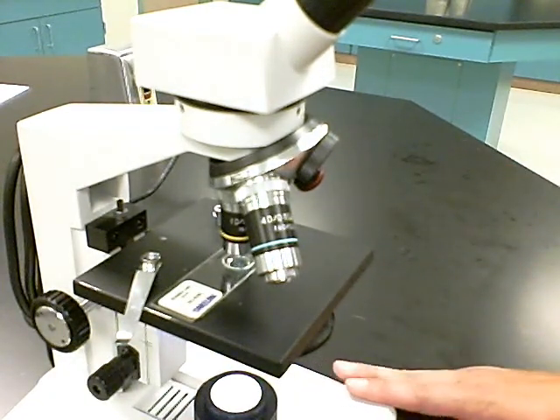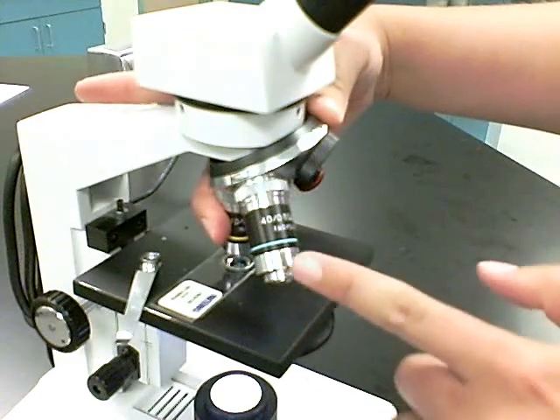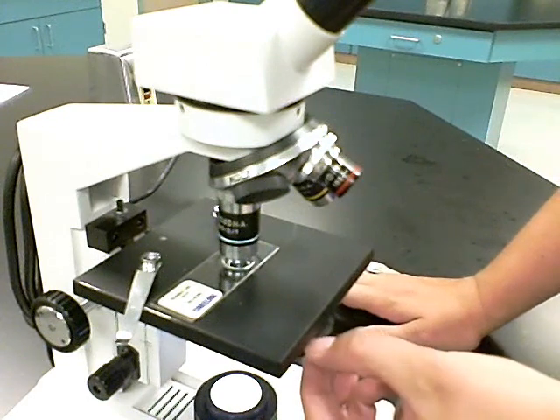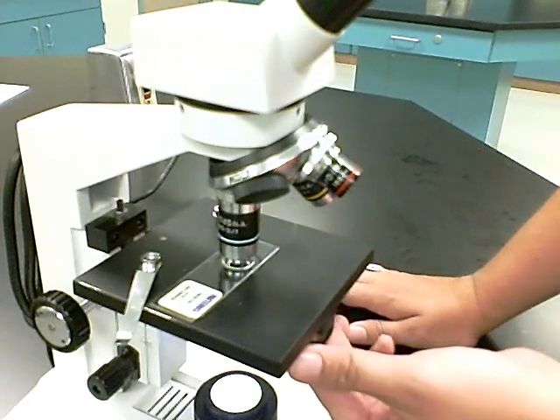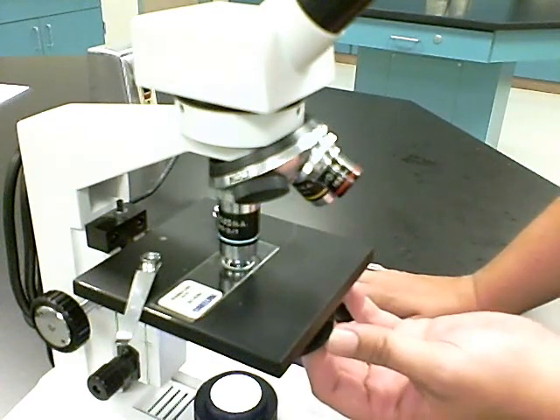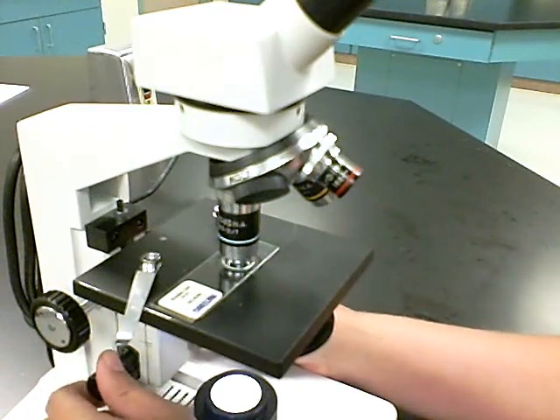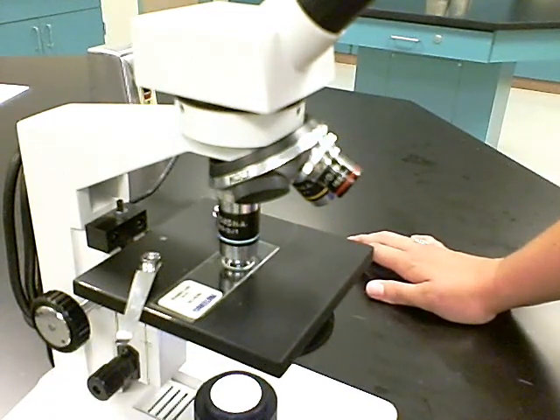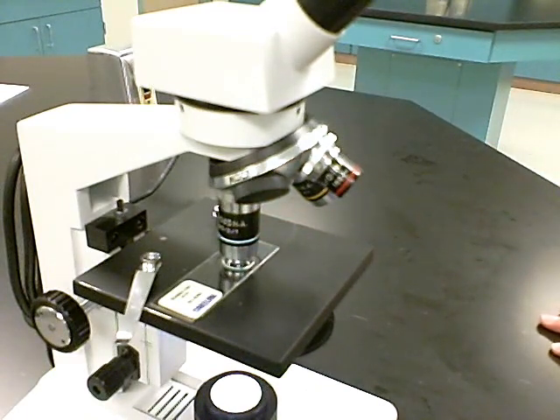Now that you're finished viewing at 10x, you're ready to increase objectives to 40x, which is the maximum magnification for this microscope. So again, you swing the 40x objective into place. Again, you want to increase the iris diaphragm, and again, it's indicated by the size of the circle on this wheel right here. For the highest intensity of light traveling through the specimen, you want the largest circle on this wheel in place. And then again, you just use your fine focus. Because these are parfocal, it still remains in focus. And now you're viewing it at a total magnification of 40x times 10x, which is 400x total magnification.